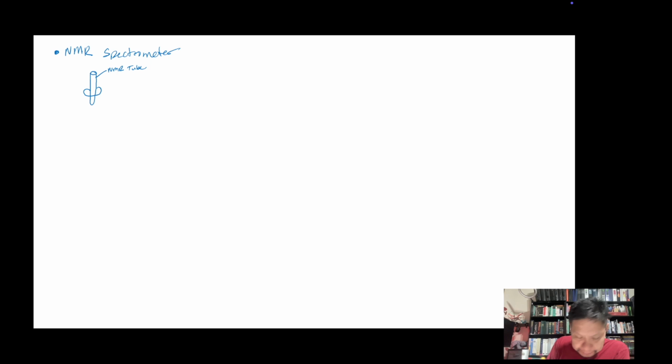called the solenoid, right? The solenoid is in the magnet. So it's basically the big superconducting electromagnet that the NMR tube sits in. We'll talk more about that in a second. And then also down here, our sample is right here, by the way, at the bottom of the NMR tube.